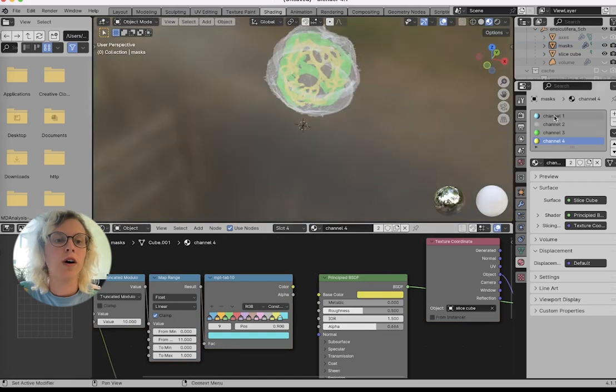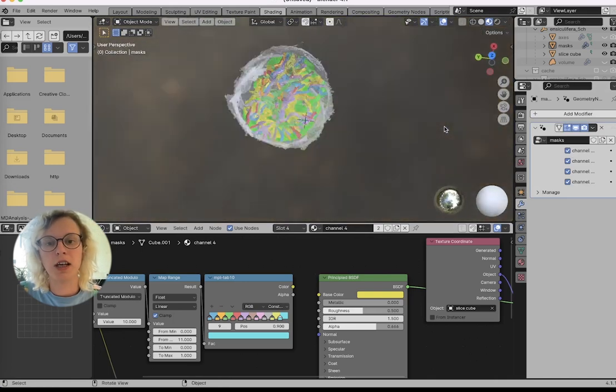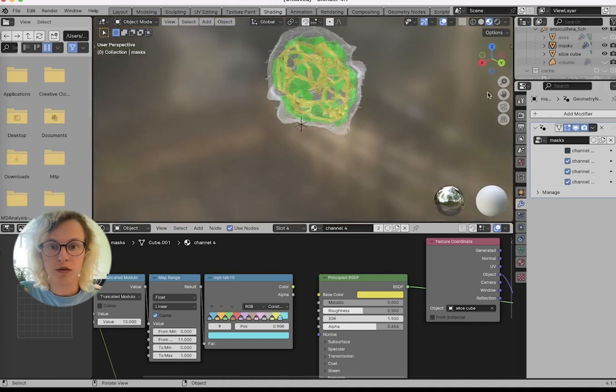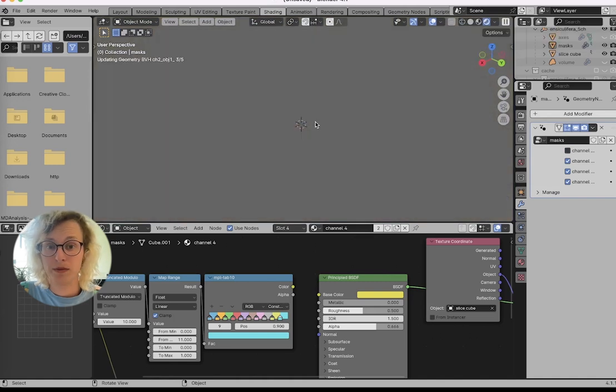And then for our trichocysts, we have all these separate segmentations, so we can keep our revolving color map, and this looks very good. It looks interesting to me. However, let's just turn them off for now and go back to the volume as well.